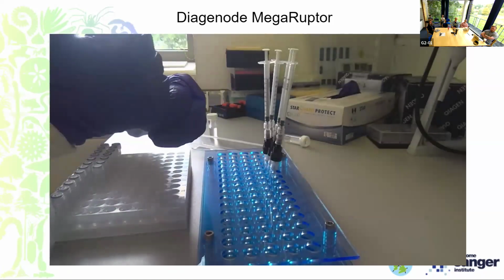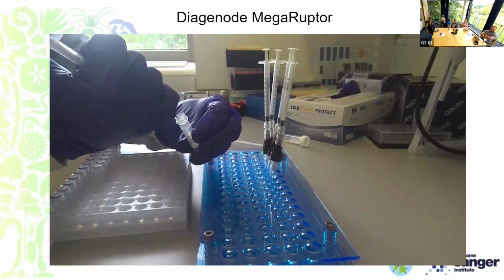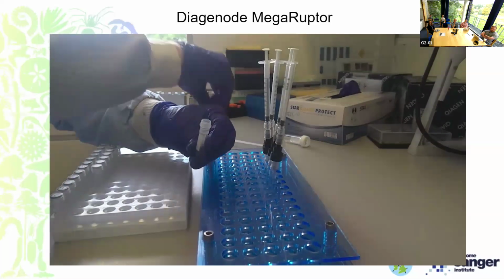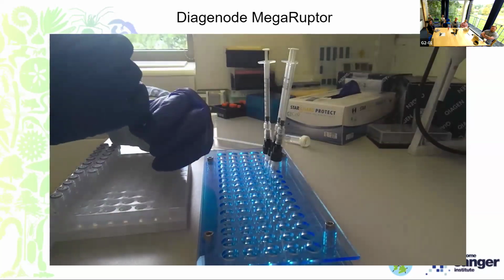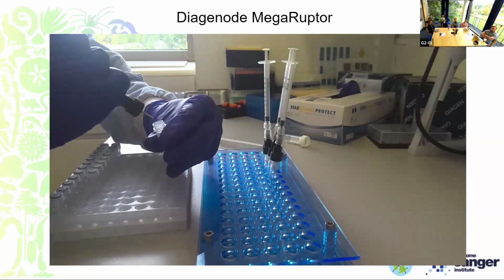So this part of the video just demonstrates that. Pop off the syringe and squeeze down the plunger to get all your DNA. Pop the lid back on, and this is now ready for a SPRI cleanup, which we'll show you in a couple of videos' time.